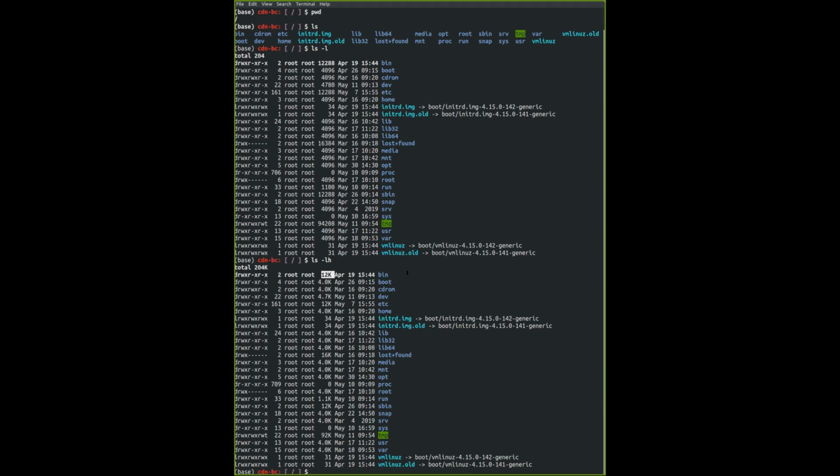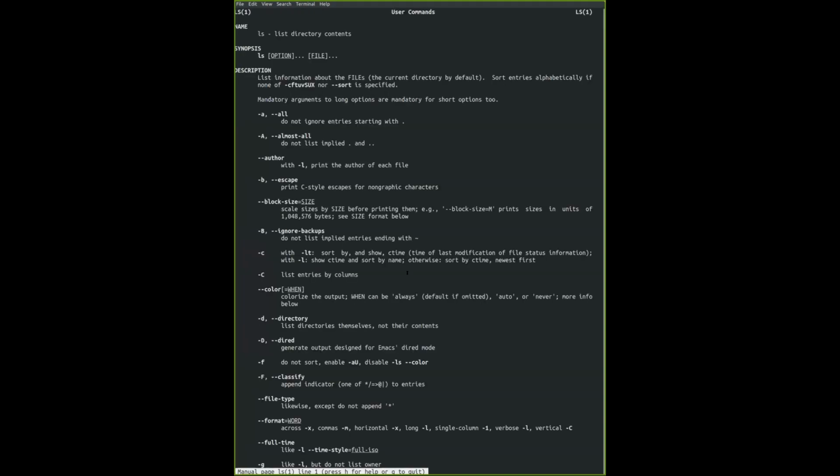So how do you know what the command is and what sort of arguments it comes with? On the Mac, there is this function called man, which is short for manual, that tells you exactly the description of these functions. On Windows, sadly, I tried this. You can try on your own, but I believe it doesn't have man on Git Bash, but it's okay. I'll give you another alternative.